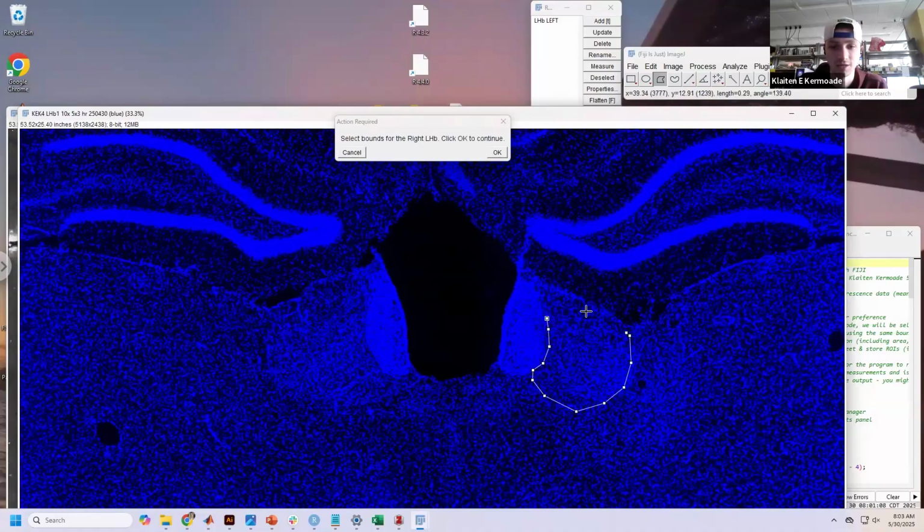So again, I'm just going to traverse the boundary. This is not as detailed as I want you to be, but I'm kind of rushing. So anyway, right click to end, click OK.